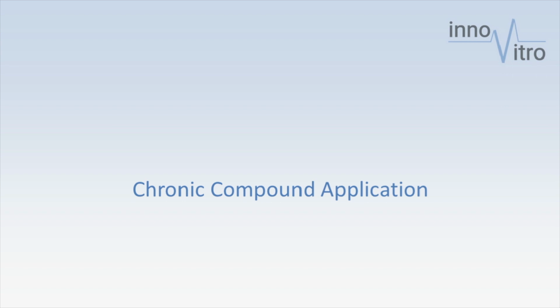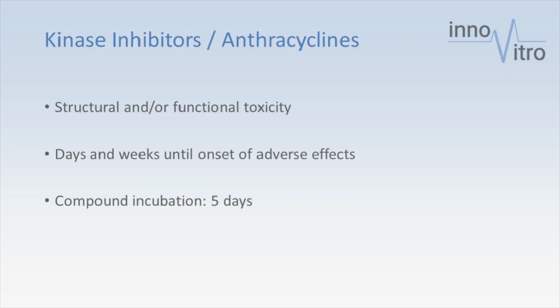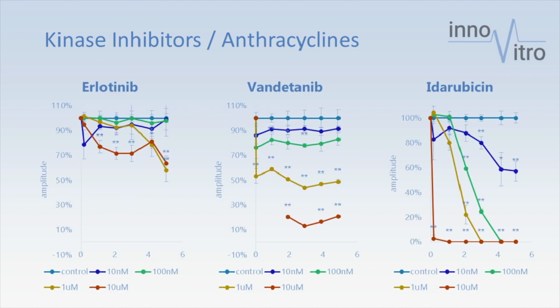To benchmark our system, of course, we also want to do chronic compound application, because not all the compounds are working within minutes. So for a lot of compounds, you need more like days and weeks until the onset of the adverse effects. That's why we chose kinase inhibitors and anthracyclines, exerting structural and/or functional cardiotoxicity. And here we decided to have compound incubations of 5 days. So usually we have 5 to 7 days of pre-culture, where the cells attach properly and start beating synchronously. And then after that, we did 5 days of incubation with compound and monitored the cells every day, starting 2 hours after compound addition.